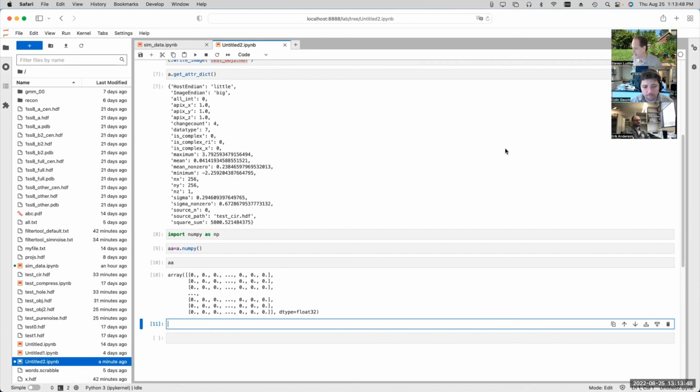Anyway, there's lots of different ways to solve any problem. Yeah, I appreciate your thoughts on that. We're still trying to figure out what the workflow is to teach people as they use this stuff. So yeah, we've got to figure it out ourselves first. Unfortunately, the answer is there isn't only one.